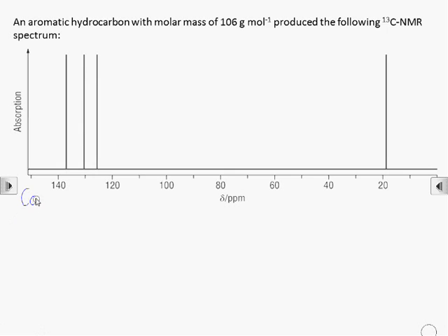In some ways, interpreting a carbon-13 NMR spectrum is more straightforward than interpreting a proton NMR spectrum. We need the contextual information about the molecule, we need to consider how many different carbon environments there are, and from the chemical shift, what each environment is like.